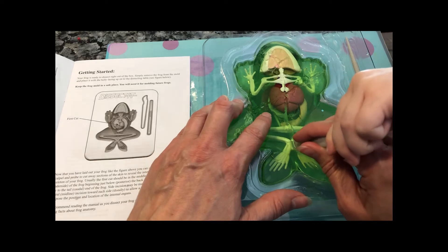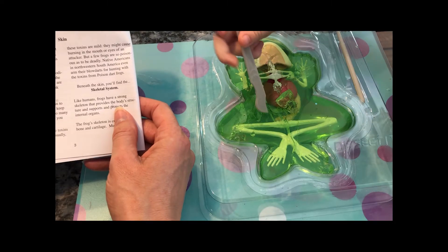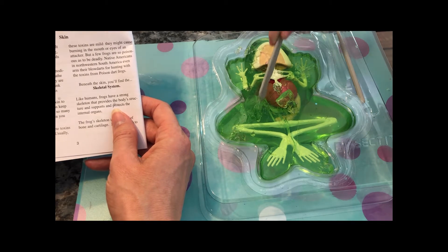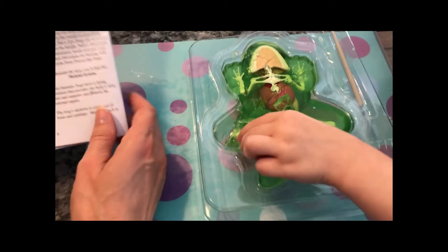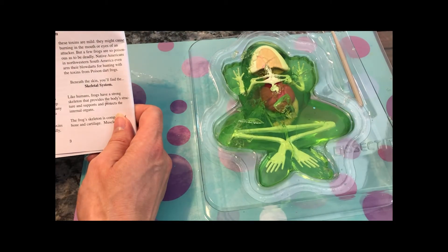Very good, Madeline. Did you get all the way through? Did you know that amphibians have glands in the skin to produce mucus? The mucus helps keep their bodies moist. That's why frogs and toads are slimy. Does the frog feel pretty slimy? It's pretty much.